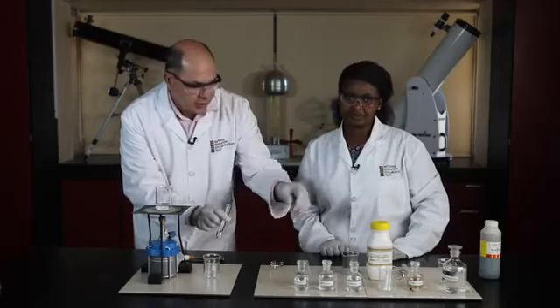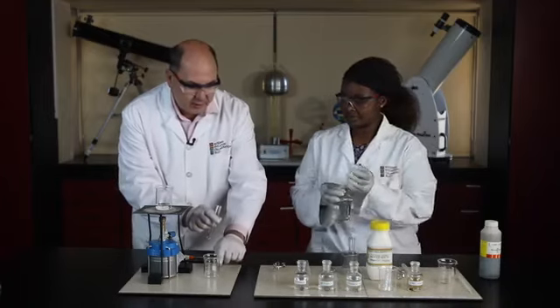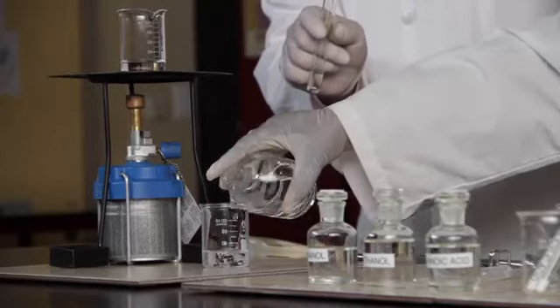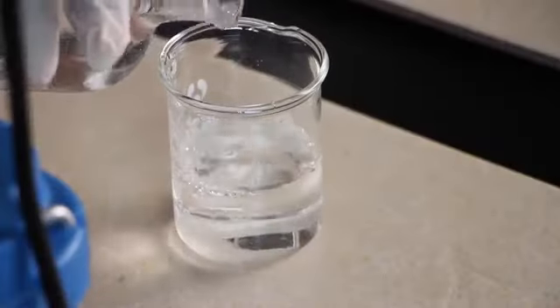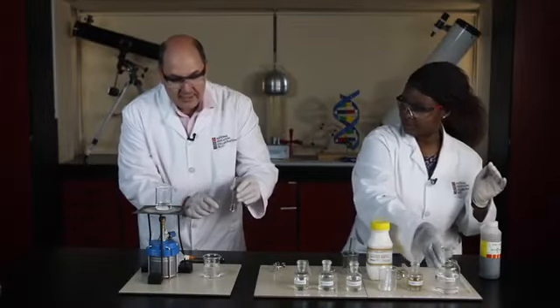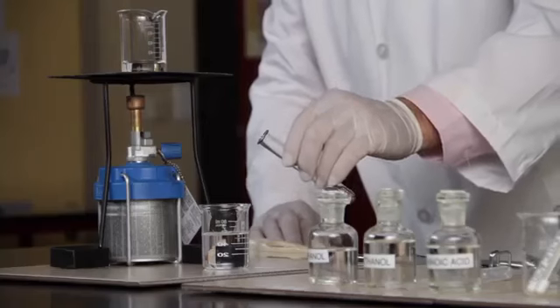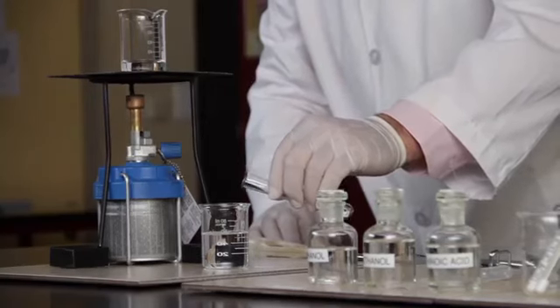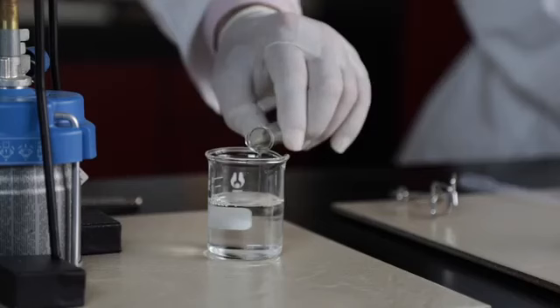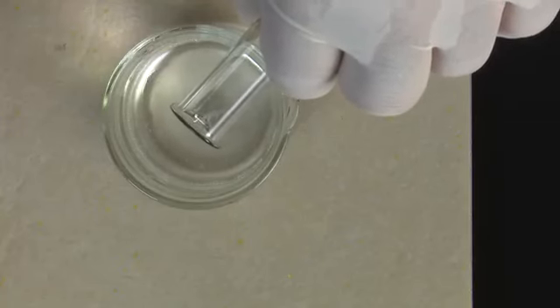So, Joyce, won't you break some sodium carbonate from there? Let's put, yeah, there we go. Fill the beaker with sodium carbonate. Looking beautiful. And now we're going to get some reaction. Let's see what happens. Just slowly, slowly add the reaction mixture to the sodium carbonate. Look what's happening.